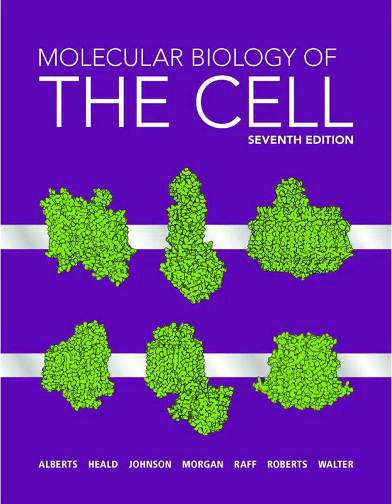Let's start with computational. That's image deconvolution. It uses the knowledge of how the microscope optics blur a single point of light, that point spread function, or PSF we talked about. You collect a stack of images at different focal depths, which all contain blur from other planes. Then a computer algorithm uses the PSF to essentially reverse the blurring process mathematically, calculating where the light most likely originated from. So it computationally removes the out-of-focus haze. Exactly. It generates a set of clean optical sections. It's a bit like how a CT scanner reconstructs a 3D image from multiple X-ray projections. Okay, so that's cleaning up the image after the fact.